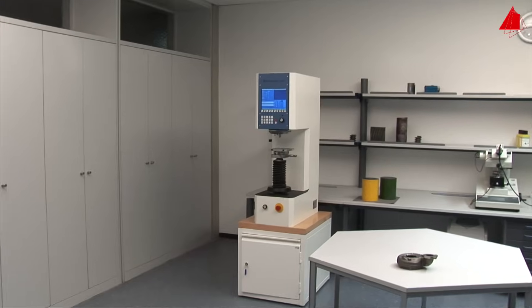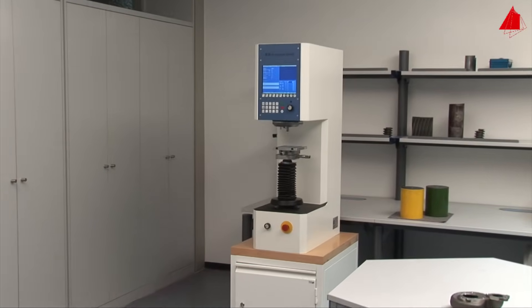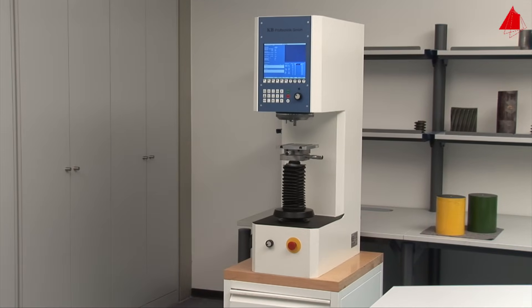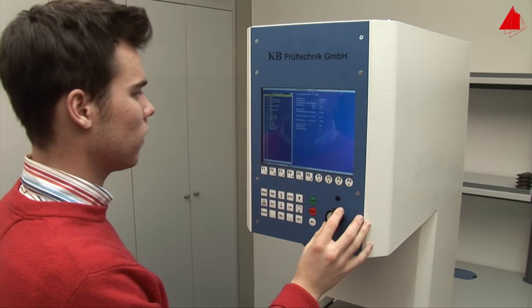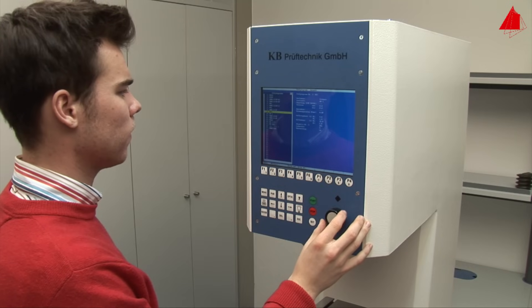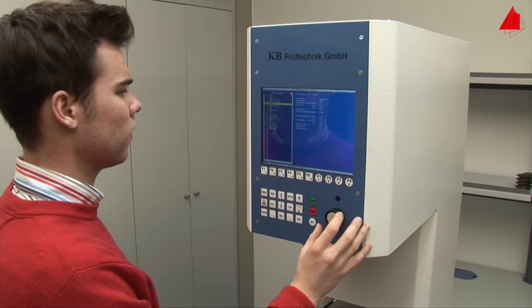First of all, the tester has to make himself familiar with the testing machine. A monitor and the control panel are positioned in the upper part of the machine. These are used to select and program different testing methods.